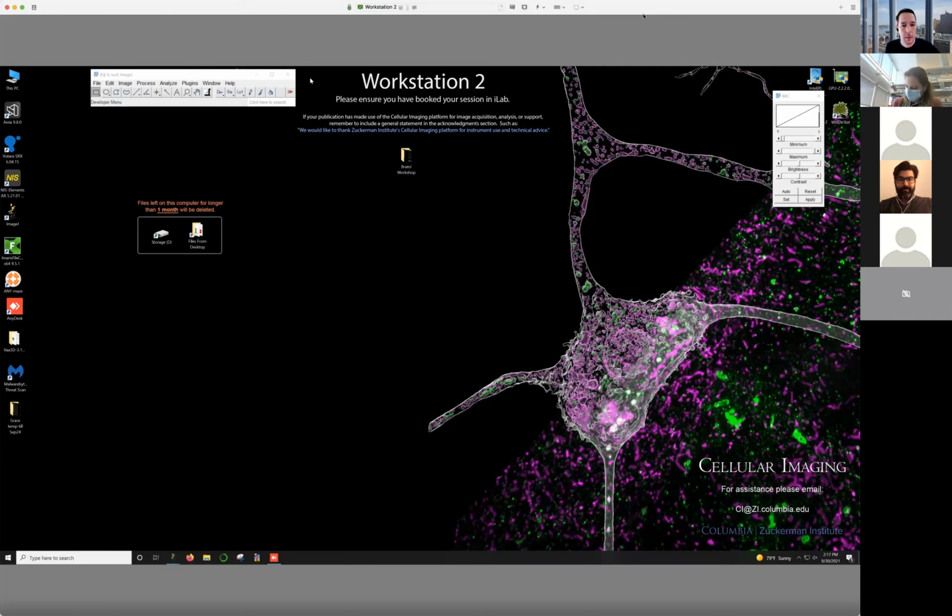And yeah, so basically BrainJ really needs to be run on a Windows computer because of some of the tools we use along with it. So Ilastik works on a Mac, but works in a different way. And so this has really been designed for a PC, but apart from that, you don't need anything special.